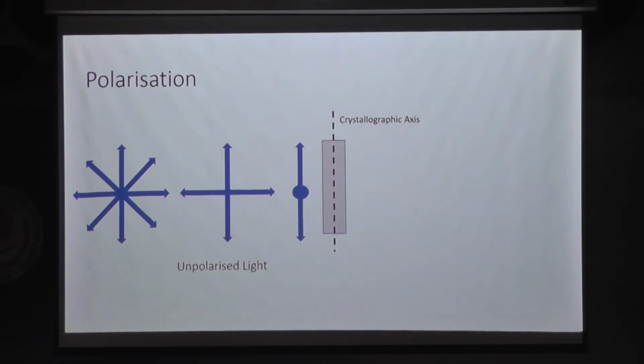This is a glass component, optics, which is used for polarization, which has a principle called birefringence. Birefringence is when a component has two refractive indexes within the crystal. So whenever the specimen is crystalline, that is where we are using this polarization.